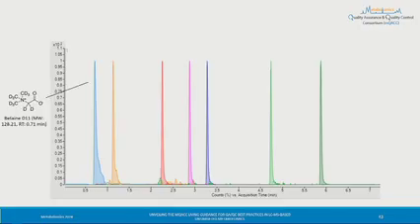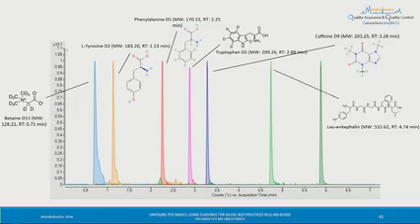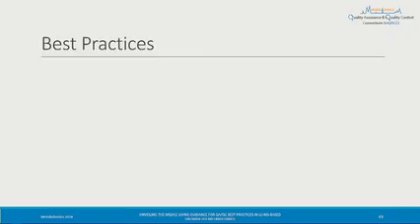And this is just an example of an internal standard mixture used in one of the mQACC members' labs. And you can see here, the idea is we are trying to cover the entire chromatographic space and have some variability in terms of chemical diversity of the compounds they are looking at. So this was, I believe, for a HILIC type method.